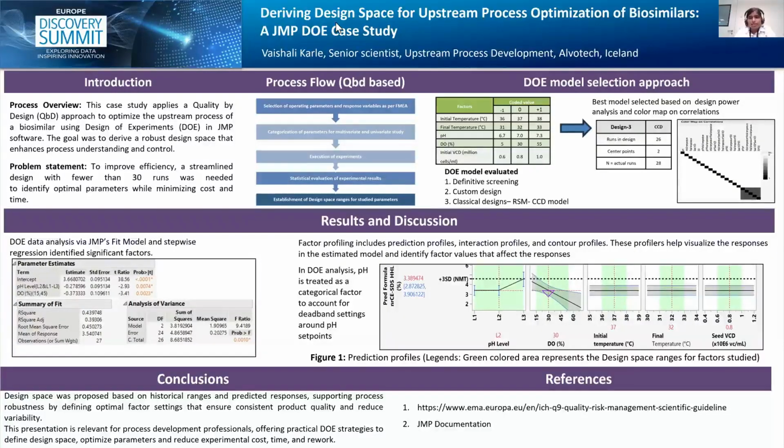So we decided to have the central composite design, and we went ahead with a total of 28 runs and the execution of the experiments to get the final data.